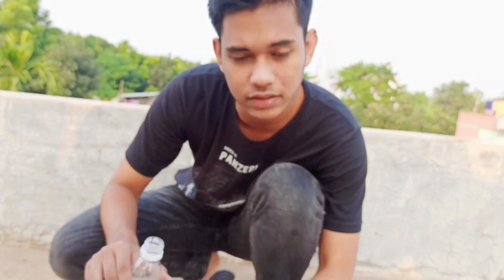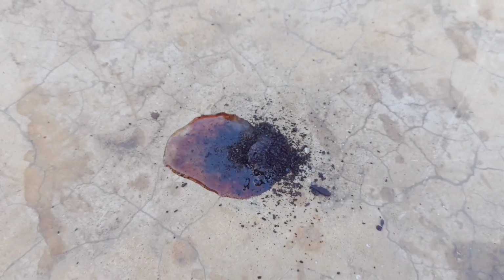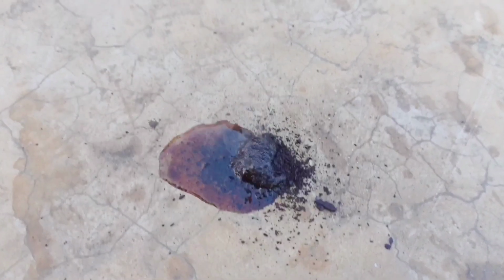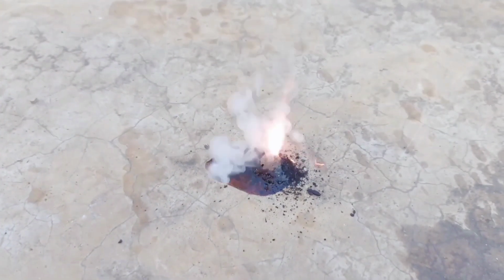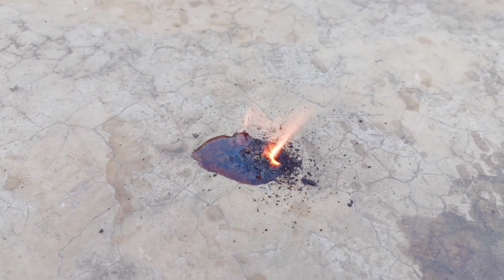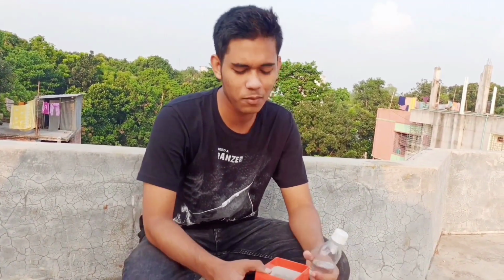If I pour some glycerine on this potassium permanganate, something will happen. Yes. Some more. And guys, it's got fire. So now I'm going to try this on a bigger level.